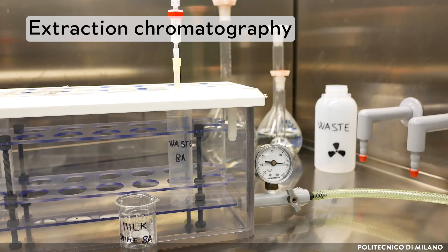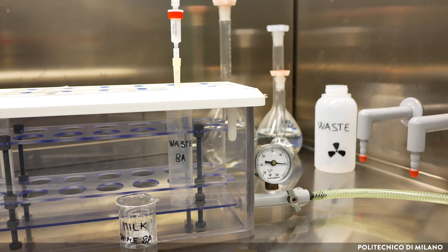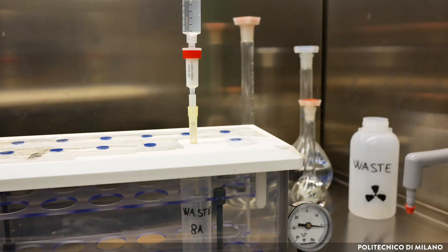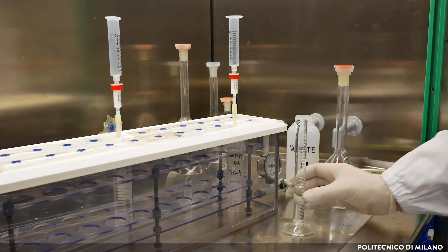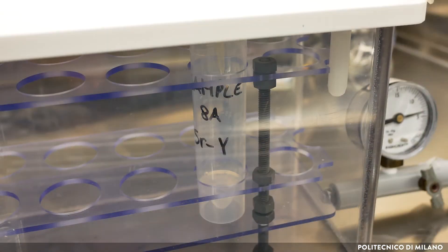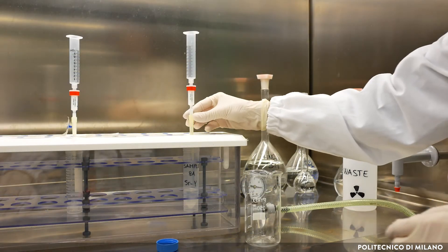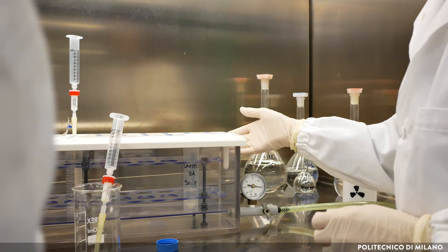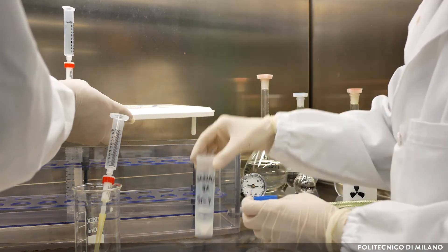The separation of strontium-90 from the solution is achieved by extraction chromatography. The sample solution coming from the pre-treatment is loaded on a resin column containing crown ether as the extraction reagent. Strontium is retained by the column, while its decay product yttrium-90 and interfering radionuclides are flushed out from the column. Strontium-90 is eluted with a suitable acid and collected in a safe place in order to wait for yttrium-90 ingrowth.